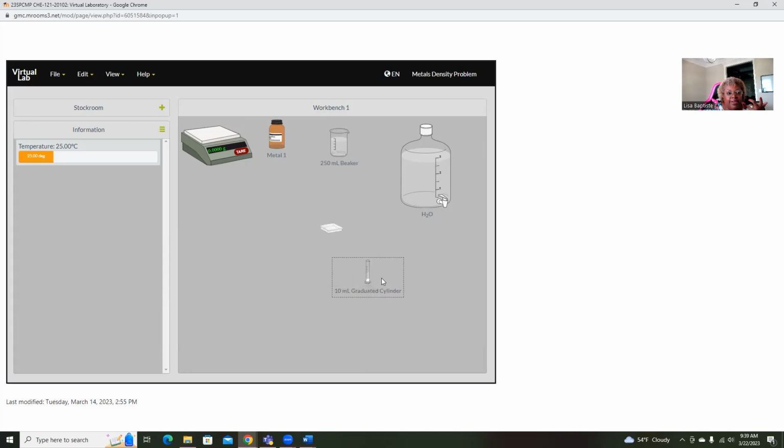Okay, anytime it goes away, just to let you know, you can click on detailed view and it'll bring it back. All right, and so we want 2 decimal places, so we're going to write 5.00 milliliters. All right, and so we have our final volume, we have our initial volume, we have our mass of our sample. I'm going to show you how we would calculate the density based on these values. Right now we are going to go to the whiteboard. So first we need to stop sharing this, okay? And then we need to bring up a whiteboard.